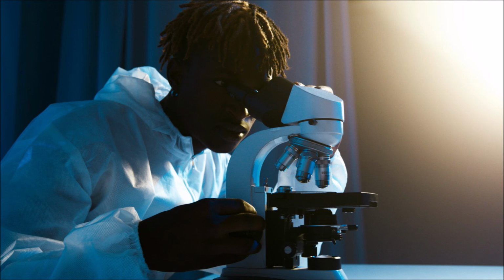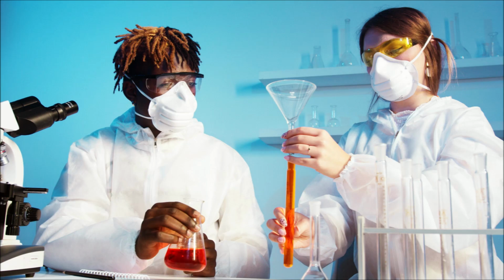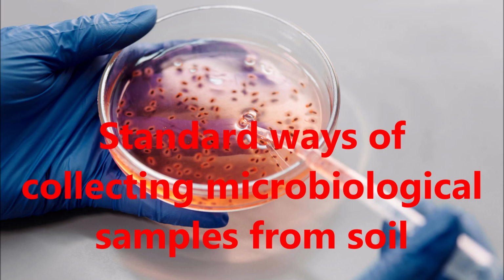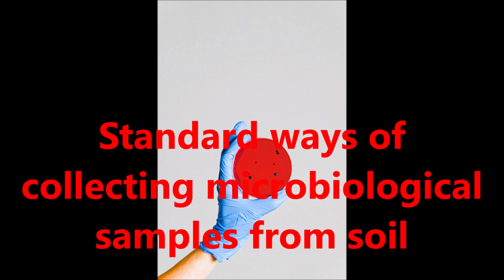The second step for the collection of the soil sample is the site assessment. When you are talking about the site assessment, you have to identify the area of interest based on the research objective. Secondly, you have to observe the site for variation in soil type, moisture, vegetation, and human activities. Based on the site assessment, you have to choose multiple sample locations if the area is heterogeneous.